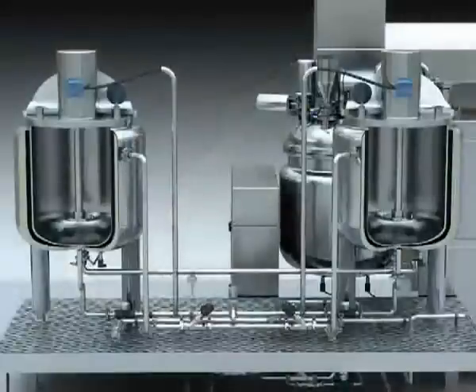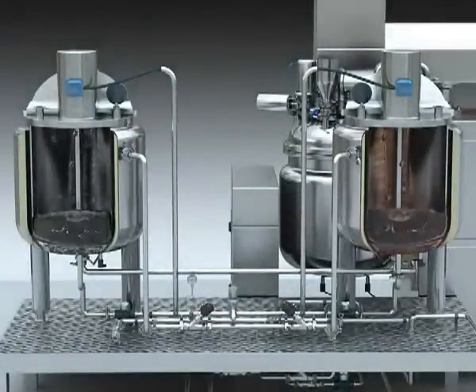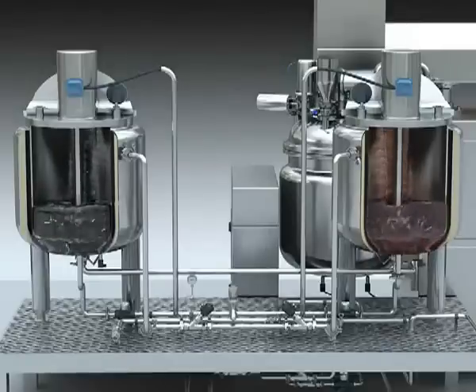After opening the half open lid, the material must be loaded into the oil and water tank, and then it will start to mix.